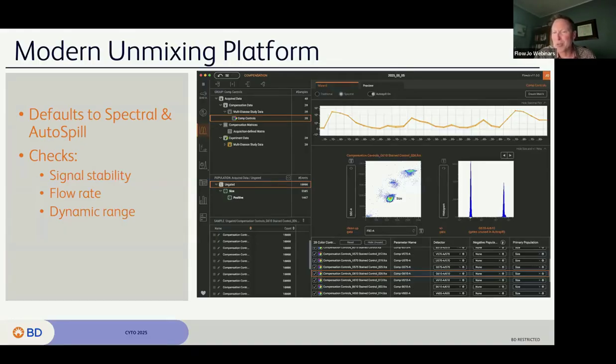I guess makes them less universal, but still common negatives, maybe? Maybe that's the right word. And anyway, they will appear under the negative population dropdown. So anything that you uncheck from the colored circle is now in a short list of things you may select as a universal negative. So if you've got some kind of negative bead or negative cell, unstained cells, you can highlight them both, use them where appropriate.